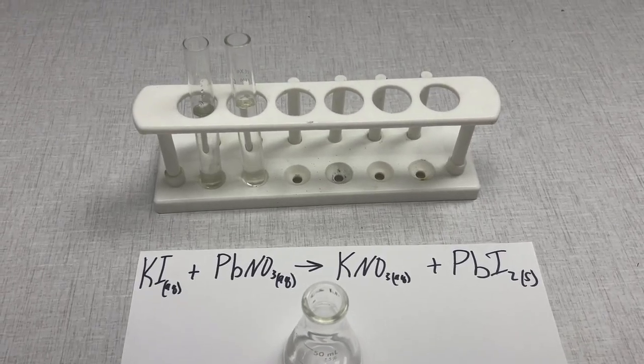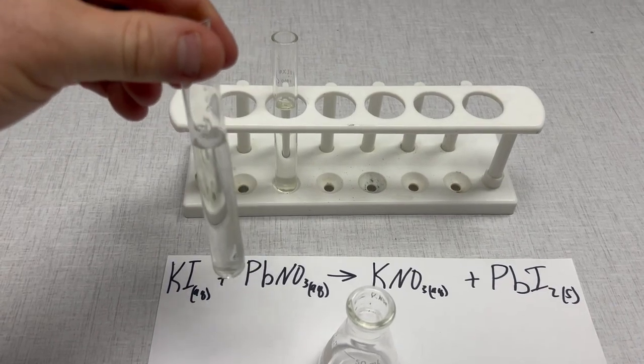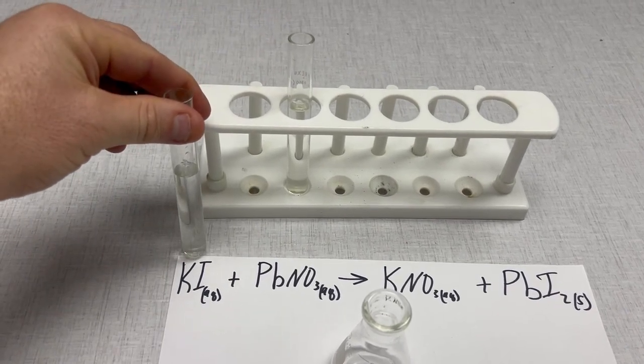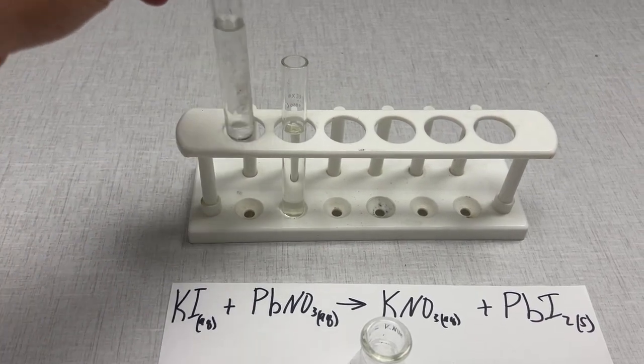In this demonstration we have two different chemicals. First, this is a clear liquid, this is potassium iodide or KI. See how it says AQ here, so we know that this has been dissolved into solution.